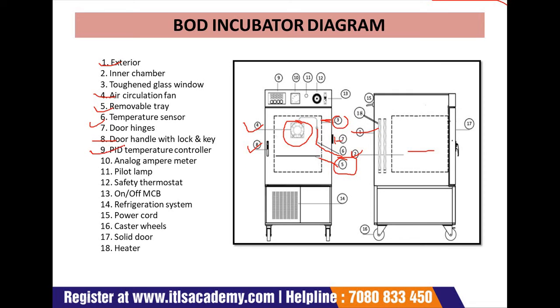9 is the PID temperature controller. So now where is the 9 number? This is the 9 number, and this indicates the PID temperature controller. And 10 number is showing the ampere meter. 11th one is the pilot lamp. This is the pilot lamp. And 12 is the safety thermostat. This is the safety thermostat. And now 13 is the on off MCB.